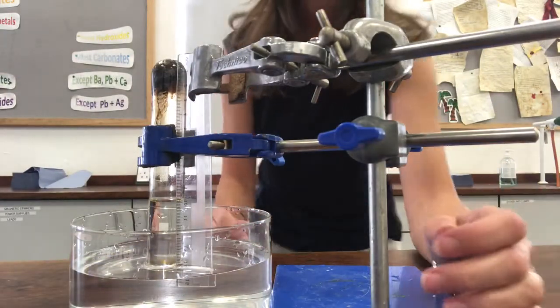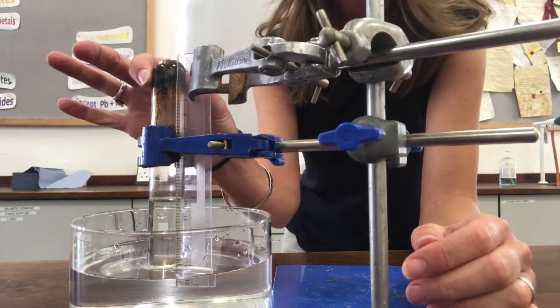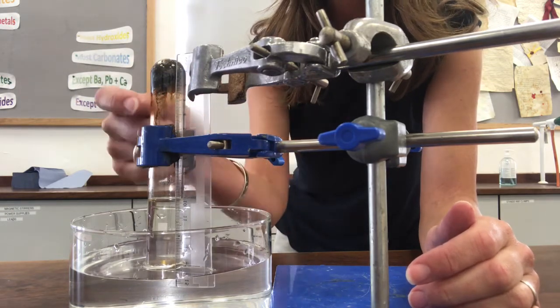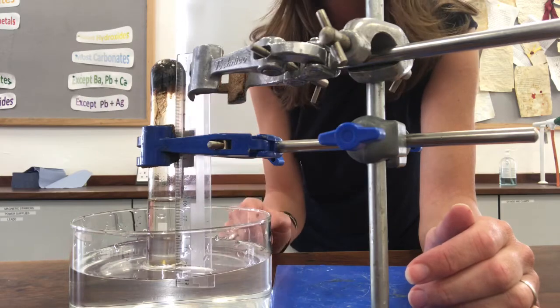So this is a week later, and you can see that the iron wool up in the top of my boiling tube has gone quite rusty. It's got blackened, and there's some tinges of orange around it. And this side of it is very orange as well.